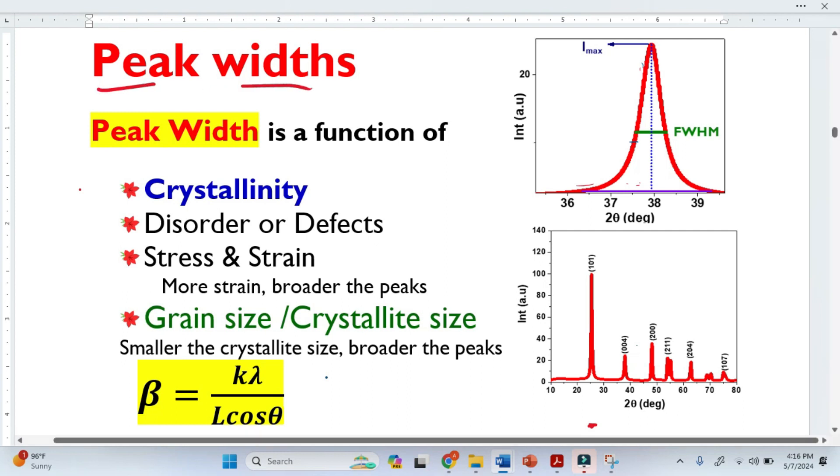Peak width is another important parameter in XRD analysis. It provides a lot of information about the materials. This is a common XRD pattern. If you look into every peak, there is a width of the peak here. I just magnified this peak here and you can see that this peak has a width. So this width of the peak provides a lot of information.